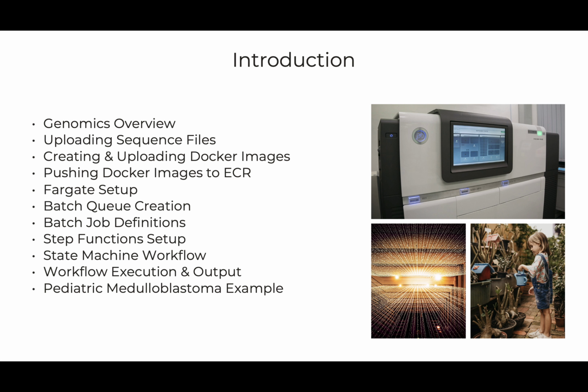As we progress, we'll assemble AWS Batch job definitions for each of our 3 genomics analysis toolsets. This will be followed by the creation of AWS Step Functions for a state machine responsible for running an orchestration workflow. The end goal is to generate variant call format, or VCF files.